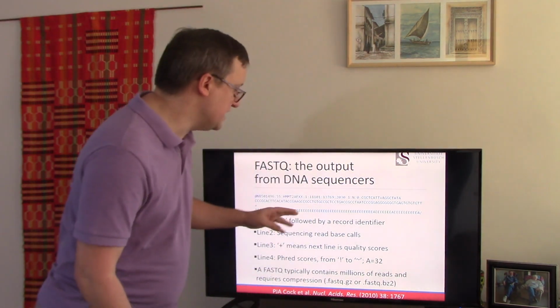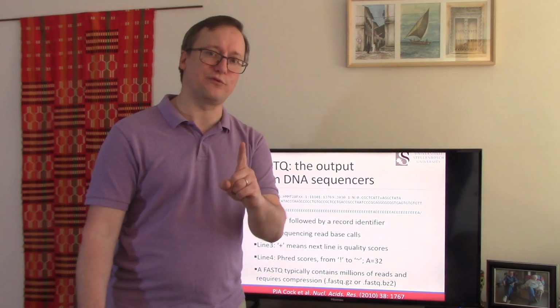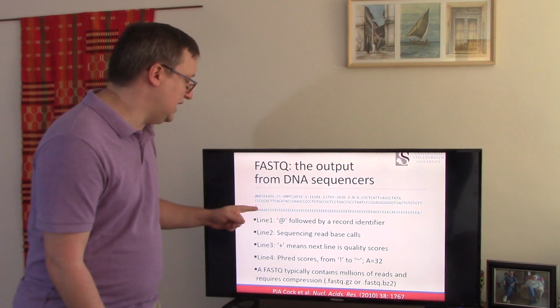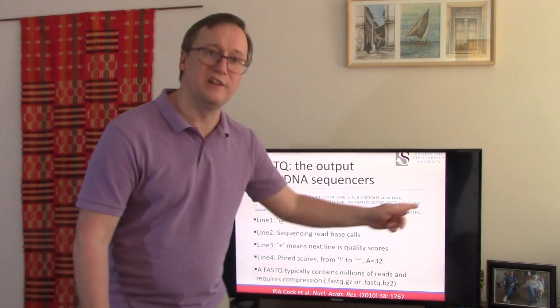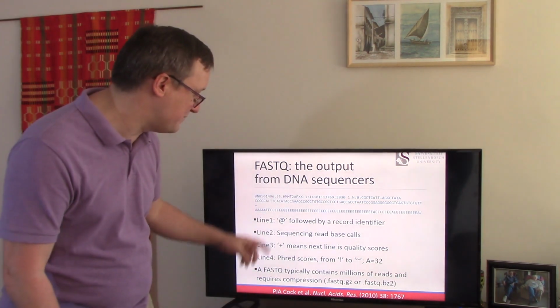So we see then that it's much more compact to write just one letter to represent each Phred score than to write a series of numbers. So in this case, each letter of this string is one quality score to describe one base call that appears above it. It's kind of an odd trick, but it's a thing that we do all the time.